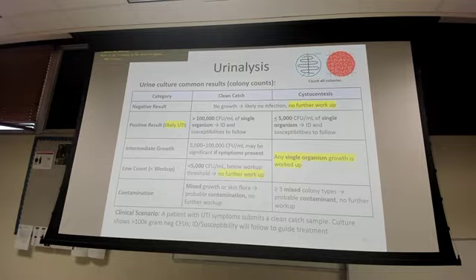All right, so for the sake of microbiology, you see on that top corner there, that is the Petri dish. And so when we get those urines back in microbiology, we'll take our loop there, we'll dip it into the urine, we'll put one streak down that Petri dish, and then we'll just kind of do this motion here, right? And pretty much we'll wait 24 to 48 hours, let it incubate for that amount of time, and we'll see what type of bacteria grows, okay? So if there's no growth, there's likely no infection, no further workup. But if we have, in a clean catch, greater than 100,000 CFU per mL, and there's one single organism, then we're suspecting there's something going on.